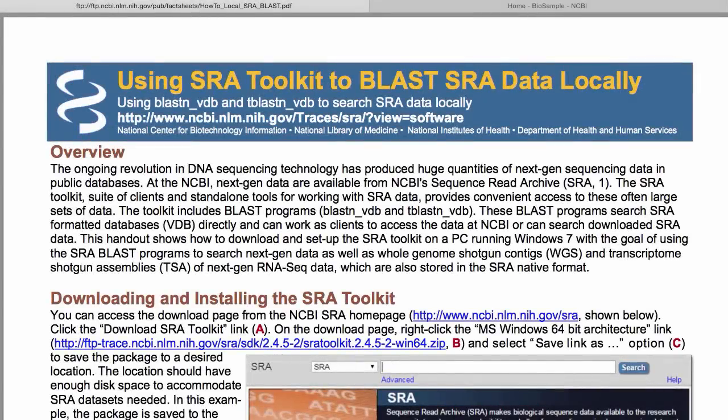This is Tom Madden again, and we'll be looking at running standalone BLAST against SRA runs. First, I'd like to mention that there are a lot of helpful fact sheets on the NCBI FTP site under pub/fact_sheets. Here we see the fact sheet about setting up local SRA BLAST. You'll find this one handy if you want to set up SRA BLAST on your own.